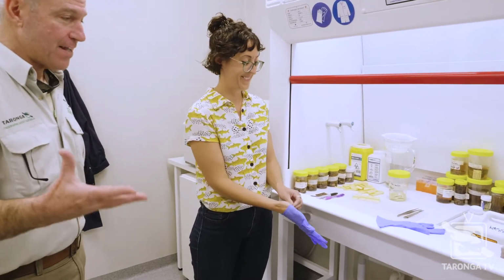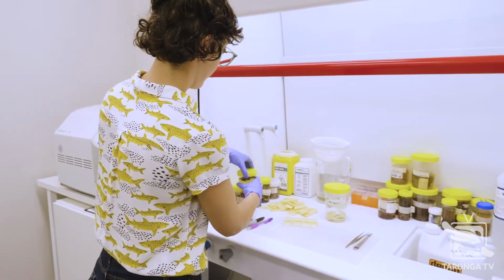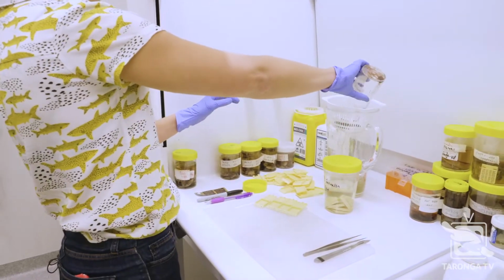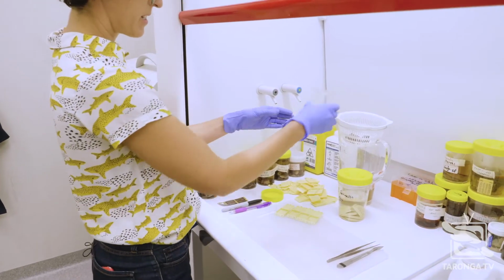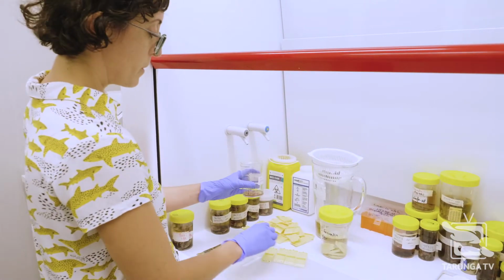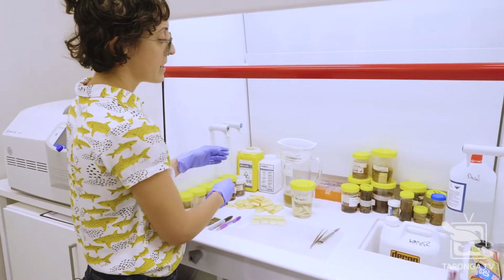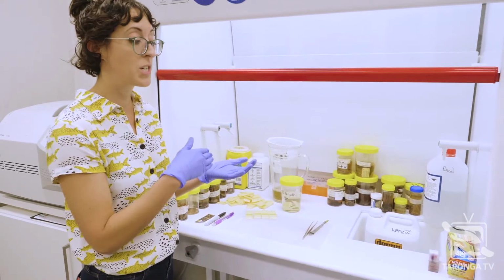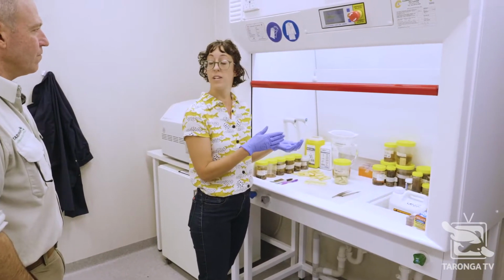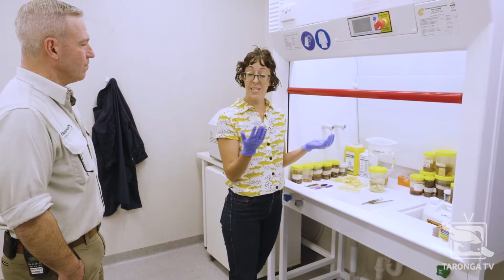This is proper fantastic investigation work that goes on, and it's critical to the health of our wildlife populations in Australia and around the world for that matter, Hannah. Absolutely is. And, you know, when we go into the field or we conduct these necropsy investigations, our immediate concern is the cause of death in that individual animal, but all of these samples form part of our archive. So we can actually interrogate tissues going back 20 years and start to ask questions about what has changed over time, whether it's something that has changed in the environment. If we're seeing a new and emerging species, we can go back and look at tissues that came into the registry 15 or 20 years ago and start to identify temporal patterns. And that's really critical with species we know very little about, particularly the marine mammals.